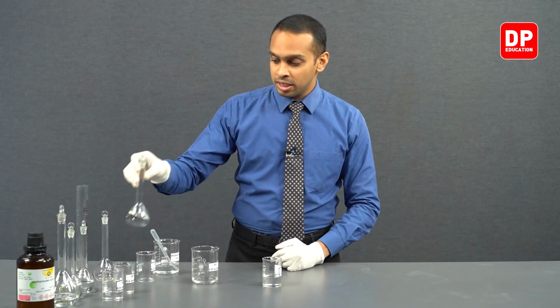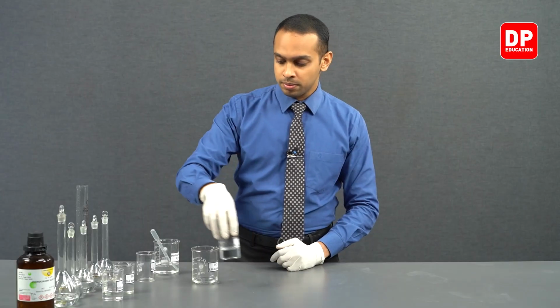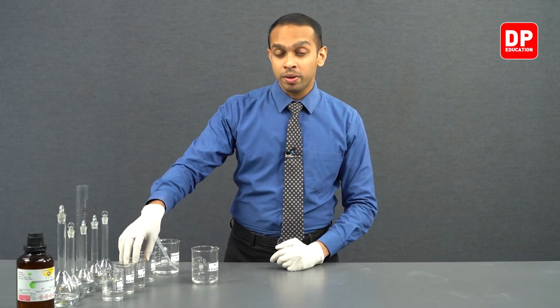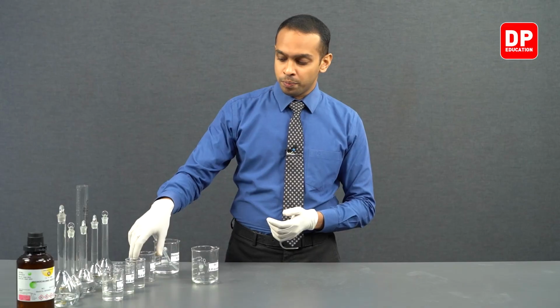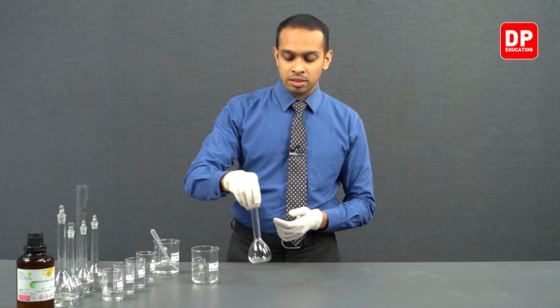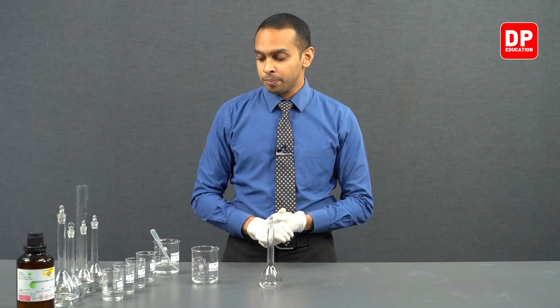We can keep this volumetric flask aside, and now we can move on to preparing our 0.2 moles per decimeter cubed concentrated HCl solution. So for that, we will need another volumetric flask.